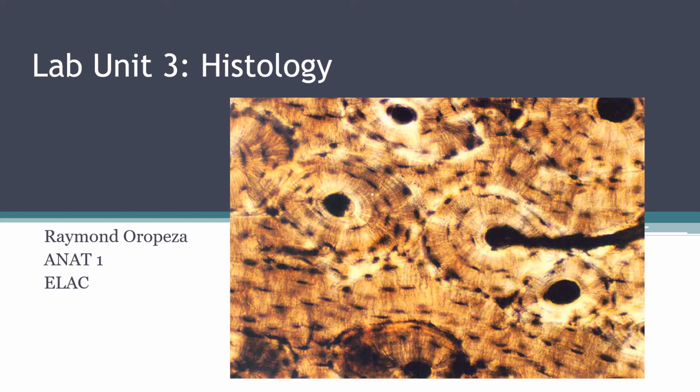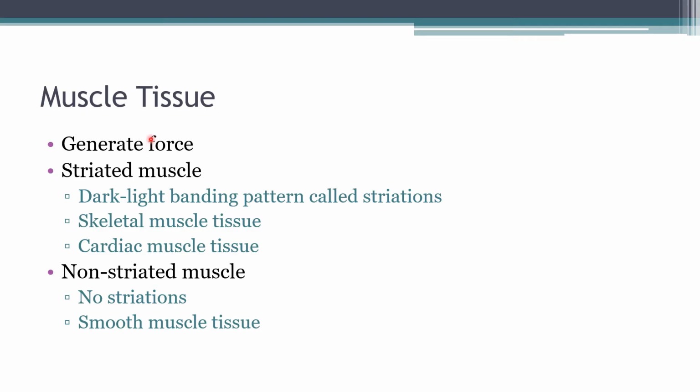Hello everyone, welcome to our last video here on histology. This one will cover muscle and neural tissue. So we'll start with muscle tissue.